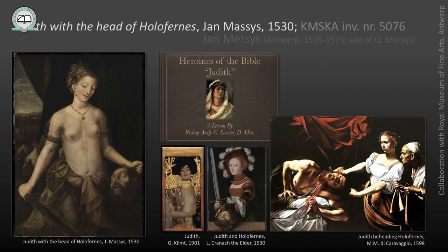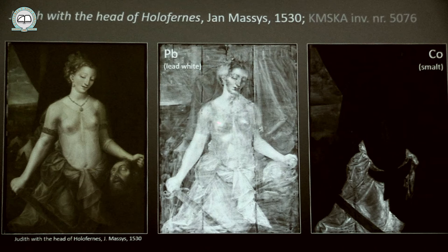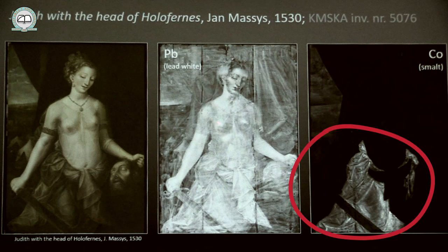Nevertheless, the original painting, which now looks a little bit flat, it's brown and another kind of brown and a bit greenish brown and a bit reddish brown, originally looked much more colorful. And why is that? Well, if we look below the surface, we don't really see anything new, but we can look at different chemical elements, and we know which elements were responsible for a certain color. So lead here is the background. That's not so interesting. We see a little bit better that there is a tent here where the lady is in. But for instance, cobalt can only be in a pigment which originally was blue. It's called smalt.